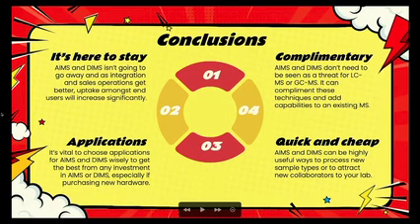It is important to choose the applications for AIMS and DIMS wisely to get the best from any investment and think about what sort of source you're going to buy, especially if you're going to purchase new hardware. Think about what's best. But the good thing is, the technology tends to be relatively inexpensive in mass spec terms, and it's a really useful way to get through high numbers of samples, introduce new types of samples to your lab, or perhaps attract new collaborators by being able to analyze samples that previously would have been a little bit too difficult or time-consuming to put through your existing instrumentation.